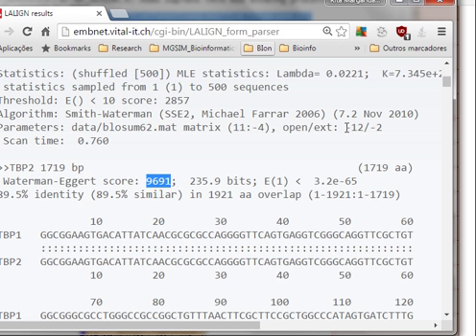If you increase the values of gap opening and gap extension, you will get a lower score because they are subtracted. Most software represents them with a minus, although gap opening and gap extension are positive values. If you change your score matrix, the substitution matrix that you have in here as Blosum 62, you may also get different results. So you should really keep your values in order to compare your results.